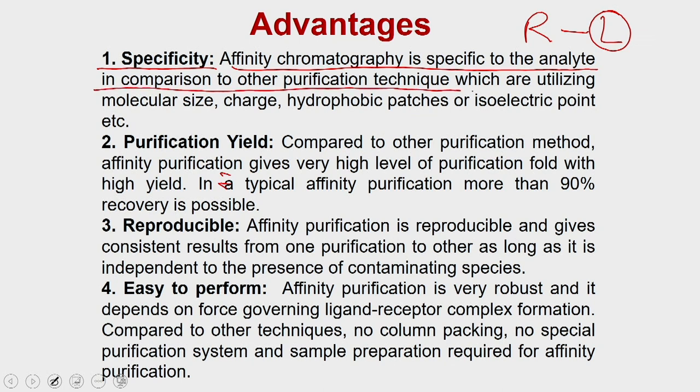In comparison to other purification techniques which utilize either the molecular size, which is the case in gel filtration, or the charge, which is the case in ion exchange chromatography, or hydrophobic patches, which is the case in hydrophobic interaction chromatography, or isoelectric point, which is the case in isoelectric focusing. So this is the first advantage, and the second advantage is the purification.